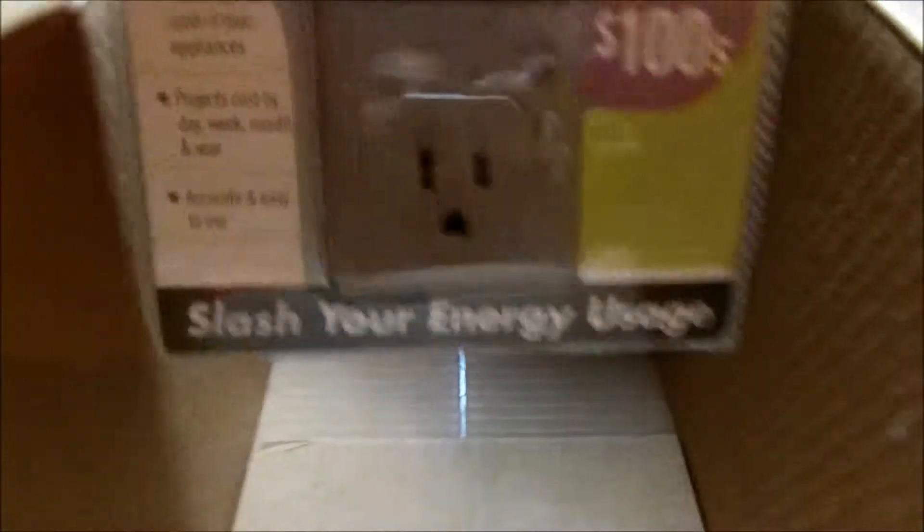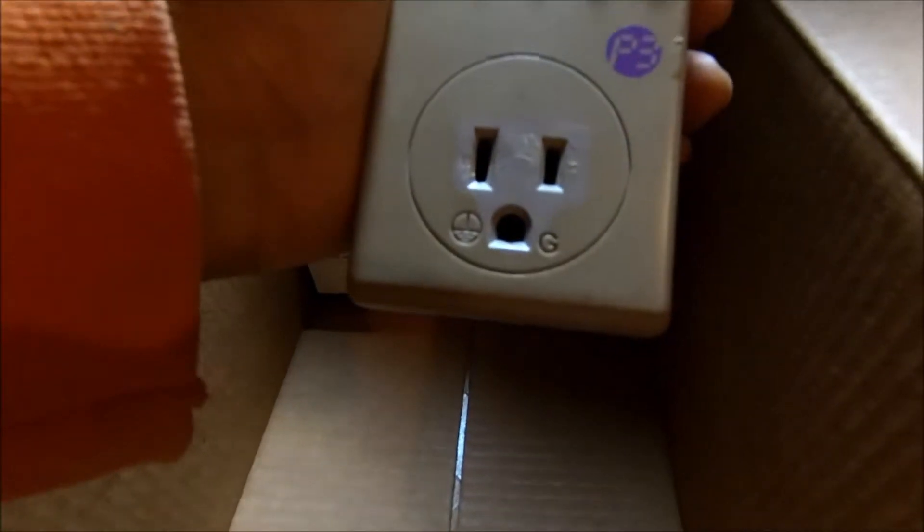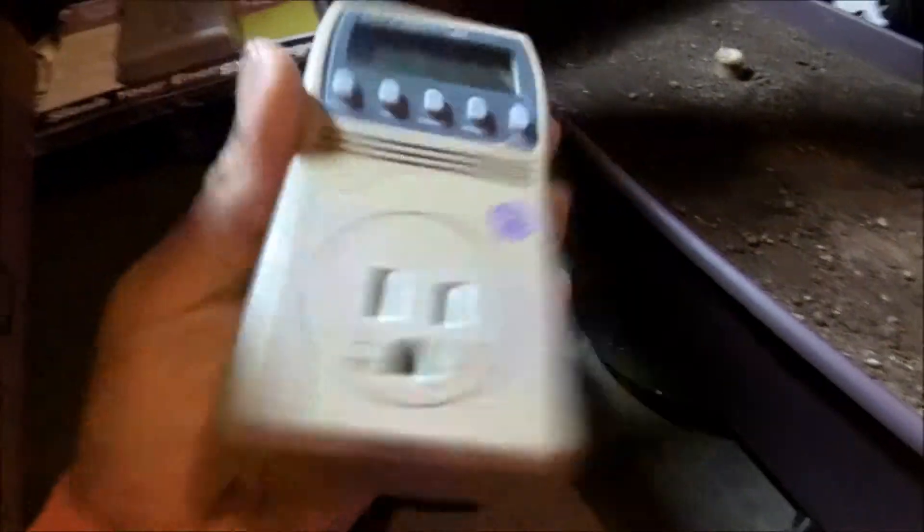So that's that one, and let me show you guys right here — it's the original one. It works but it's not as good as it used to be. I will say it's better than the new one as I tested it. They're not all that great but it gets the job done.